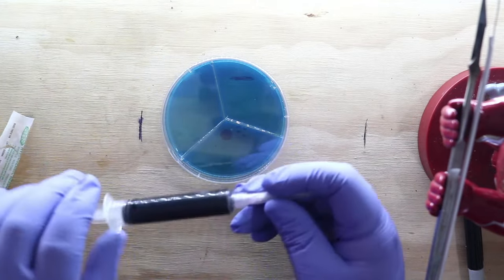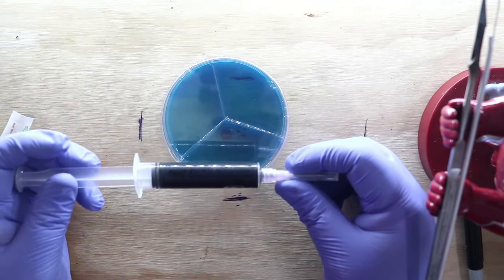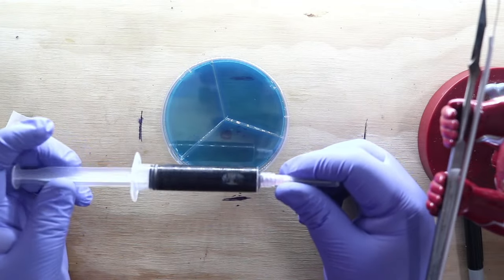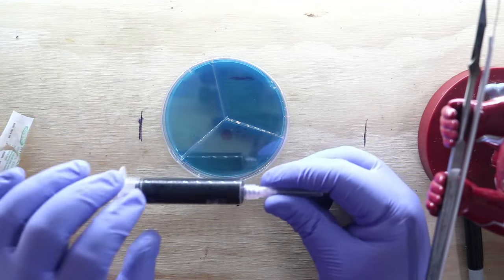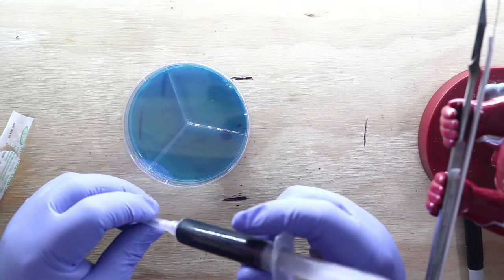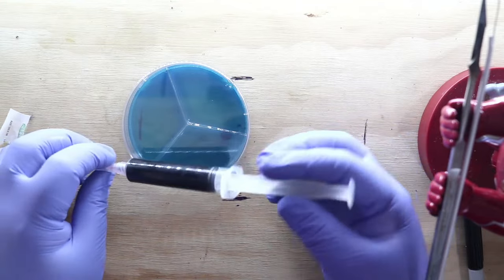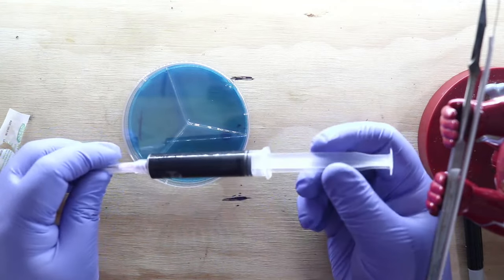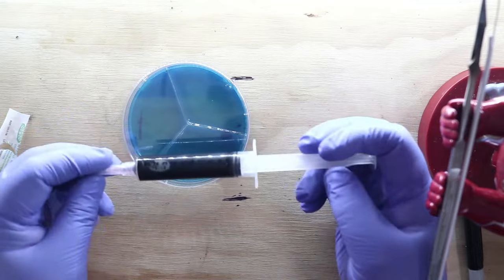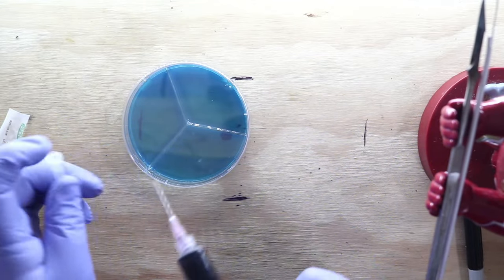Oh my gosh, Samantha, this actually is so thick. Is that the green elf cup? That's the green elf cup. That is like downright hairy. It's going to be sludge. That's an air bubble, isn't it? I may have a hard time doing this, guys. I may have to grab another syringe. Hey, it'll stain the table. That'd be awesome. Well, we can try. This is green elf cup. That's why it looks like mud. It's not contaminated. Okay.